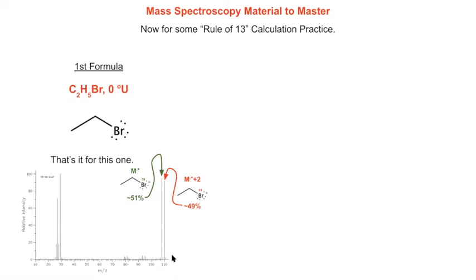What about this little guy right here? Say this is 108. What about 109, that little 109? What can cause that? There isn't really much bromine 80 isotope because bromine 79 and 81 make up about 100%. But the rest of the molecule, you could have like a carbon 13 here or a carbon 13 there, or a hydrogen deuterium here or deuterium. So if you have either one carbon 13 or one deuterium, then that would make that one slightly heavier at 109.